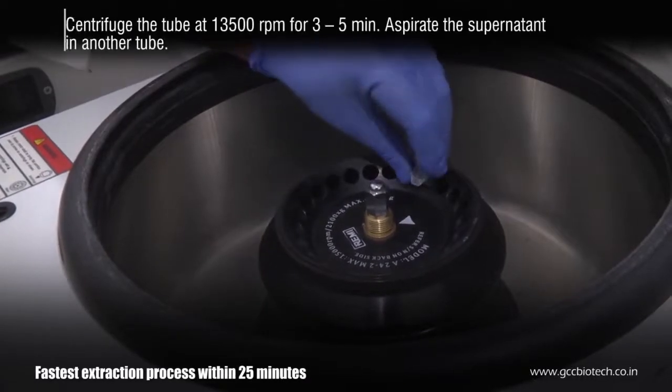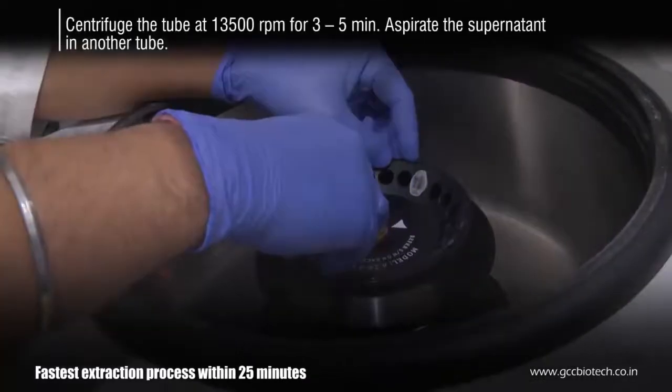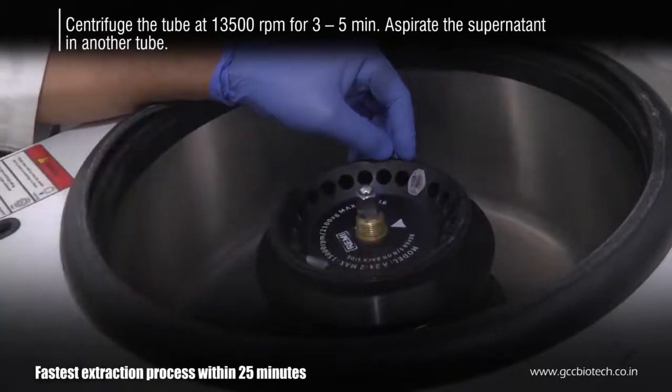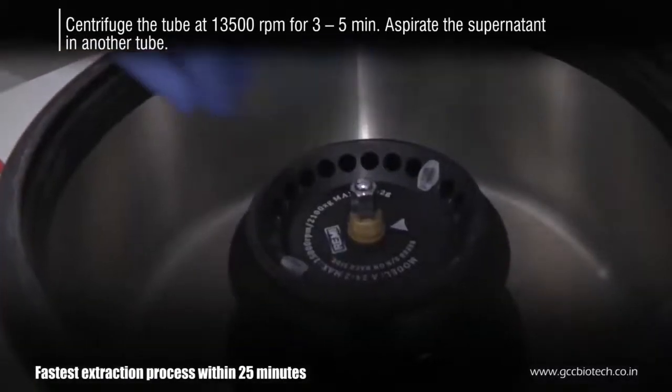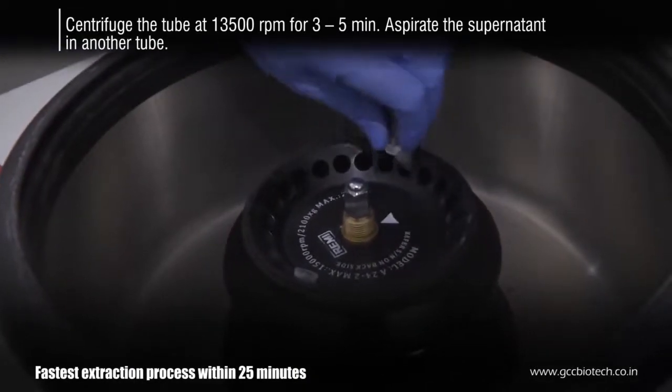Centrifuge the tube at 13,500 rpm for 3 to 5 minutes. Aspirate the supernatant carefully into another 1.5 ml tube. Note that the supernatant contains nucleic acids.